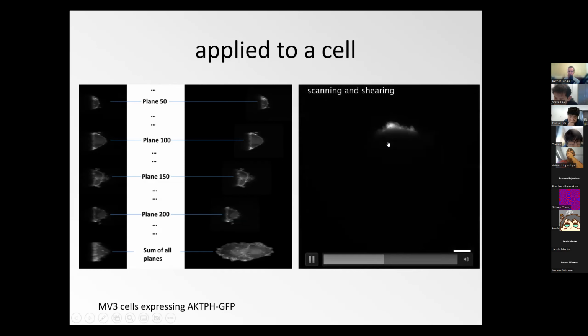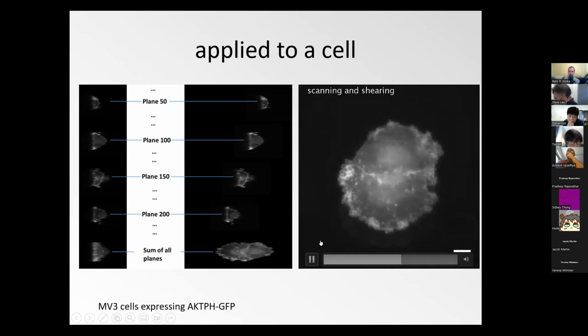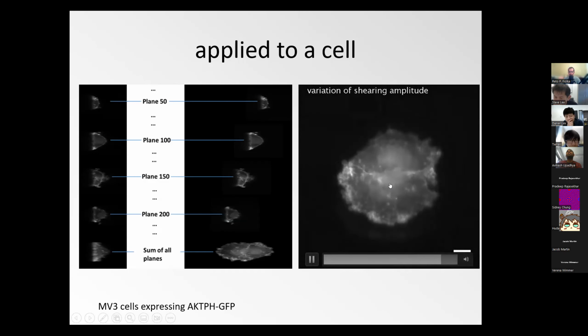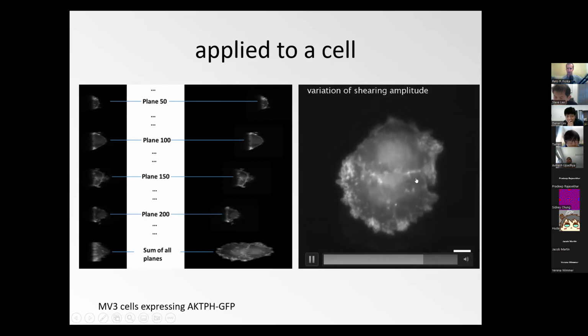So here we again sweep the focal plane, but we also add, with the same signal generator, a lateral shift on these galvos to create the lateral shift. And once we reach the frequency of the camera, we get an analog projection that is obviously different than this one here, which is more from the side, and this one here is more at an angle. And then if we change the voltages of the signal generator, so again, this is done without any computation, this is really purely analog, if we change the amount we shift the images, we can actually create a rotated view with an additional stretching, with scaling. So if you go really to the extreme, the image also becomes a bit elongated, but nevertheless, you may appreciate that visually, to our human brains, it looks like the image is rotating. And per the shear warp transform, it actually does.